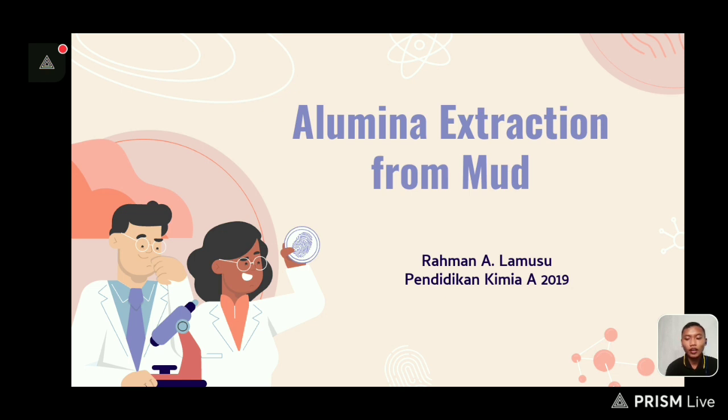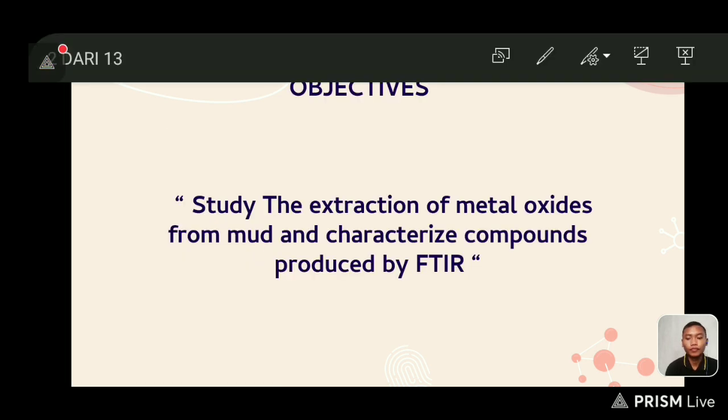In this video, I will explain an experiment entitled Alumina extraction from mud. The purpose of this experiment is to study the extraction of metal oxide from mud and characterize the compounds produced by FTIR.